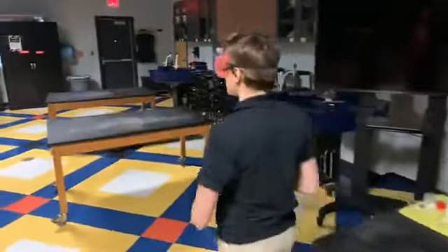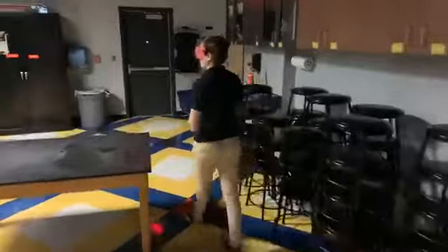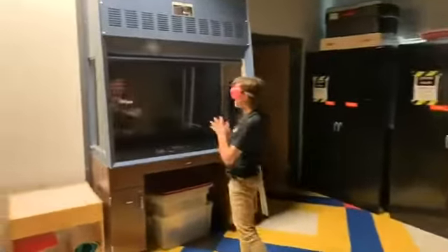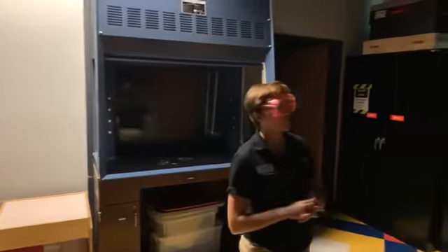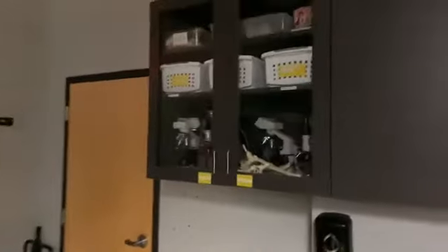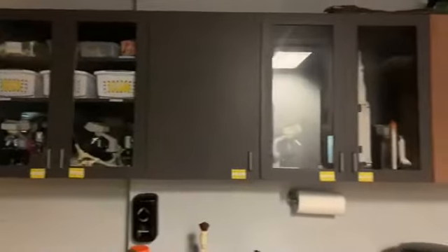This is where we can do our most volatile chemistry experiments, things that are going to produce fumes that might not be safe for us to deal with. We can do right in here. And, of course, we have all of our microscopes and different types of samples of fossils and bones and different cool things that we can show you when you come and visit us.